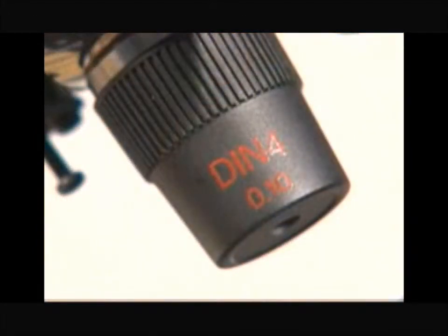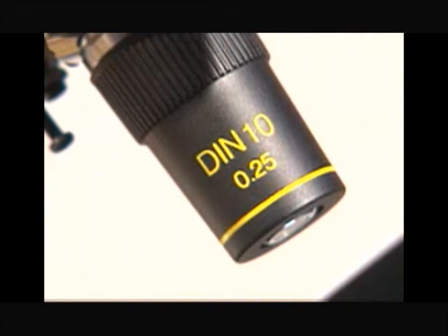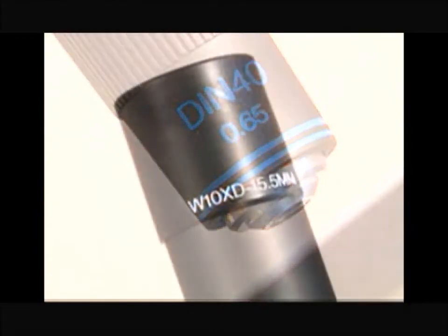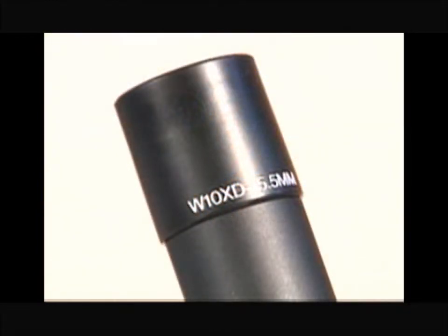This objective will magnify an object 4 times. Its power is 4. This objective will magnify an object 10 times. Its power is 10. Finally, this objective will magnify an object 40 times. Its power is 40. The eyepiece of a typical student microscope usually has a magnification of 10.